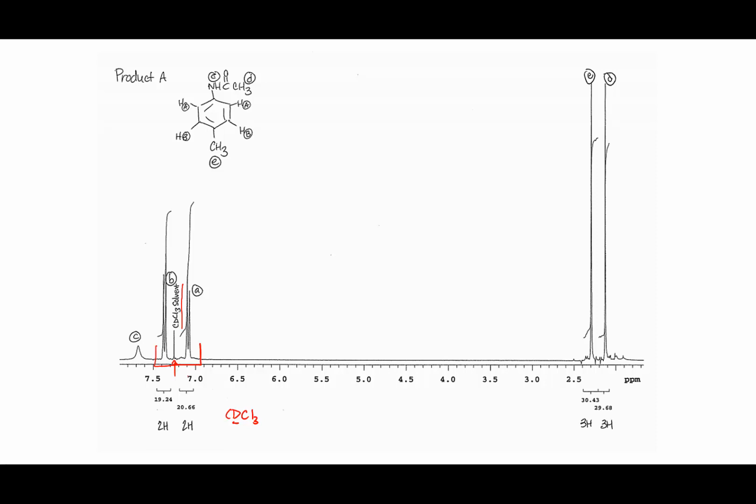You may wonder, well, where's the TMS at zero peak that you talked about in lecture what seems like a semester ago? We actually don't use TMS as a reference. We use the residual amount of protons in chloroform, the CHCl3 that's in CDCl3, which is only like 0.01%. We use that as a reference.